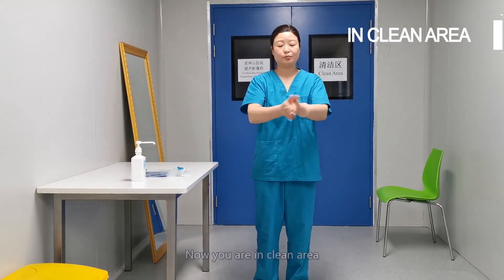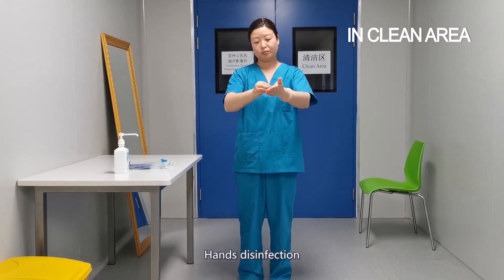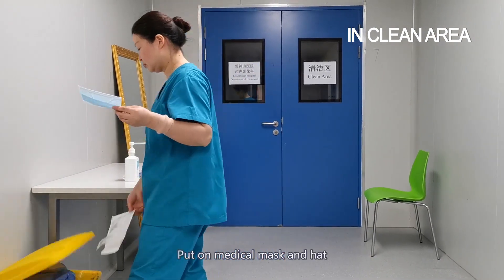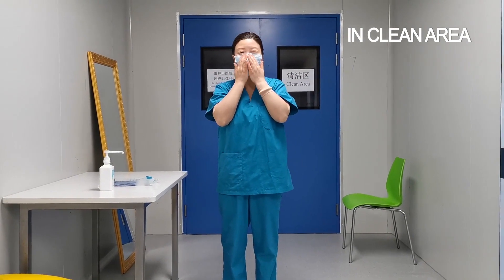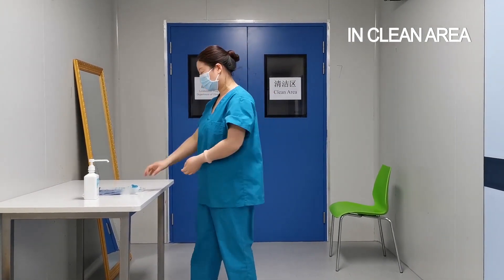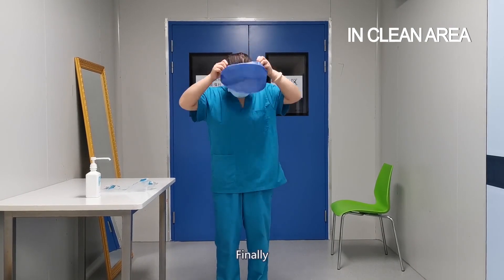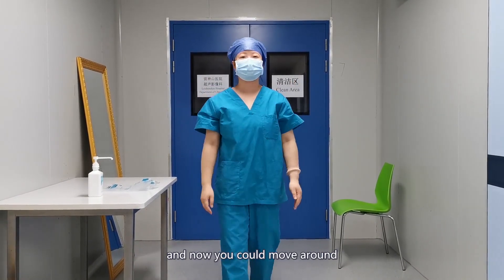Now you are in the clean area. Close the door and no stepping back. Hands disinfection. Put a medical mask on. Finally, wash your hands thoroughly with flowing water and now you can move around.